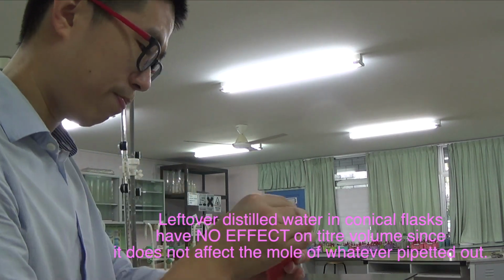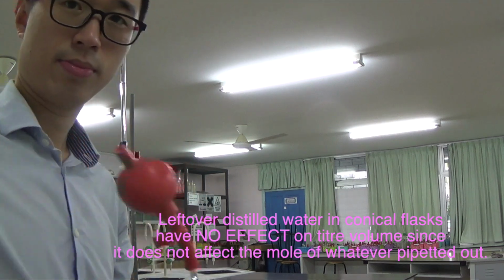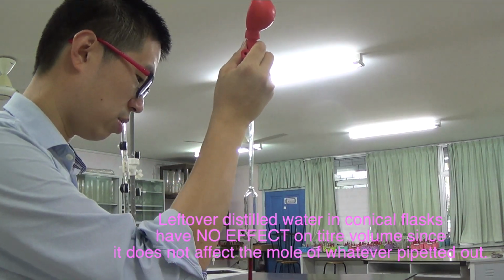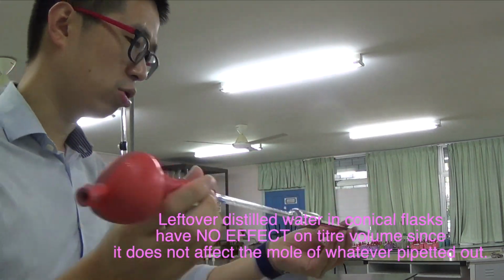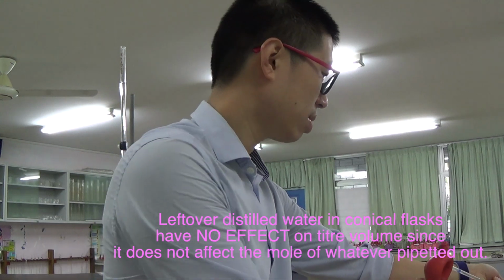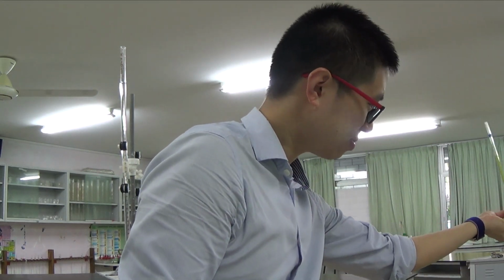I haven't rinsed my pipette with the iodine yet. So this is a pipette and this is a pipette filler. What we're going to do is suck out a little bit of this. As I suck out a little bit, you can see it is brown in solution. I don't need a lot of it, I just need to do rinsing. So I'm just swirling it around. Gotta be careful, I don't want to stain my cloth. Take out the pipette filler and then rinse it like that and you should be alright.